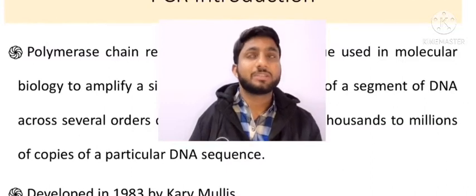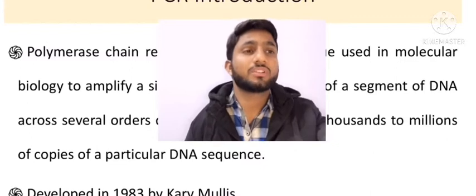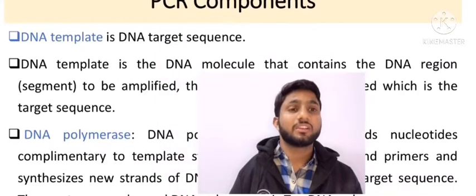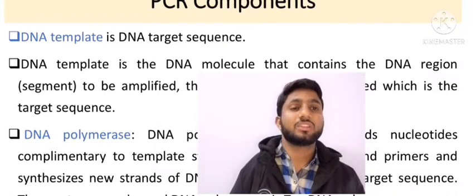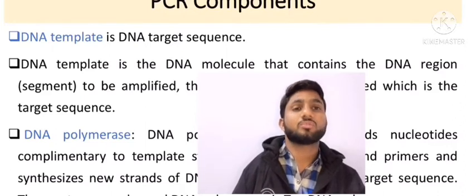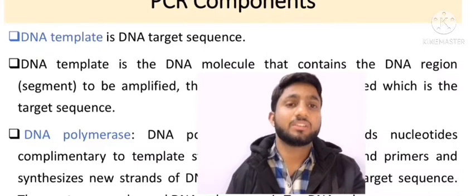Similarly, we should know about the different components, what kind of components we actually require for the amplification of DNA. For the amplification of DNA we require certain components which are known as PCR components. The first one is a DNA template or a target sequence.